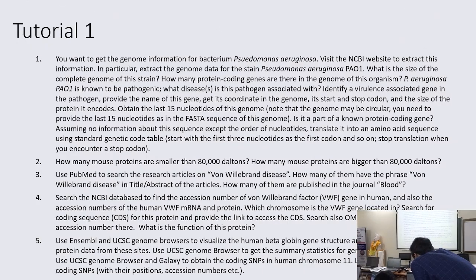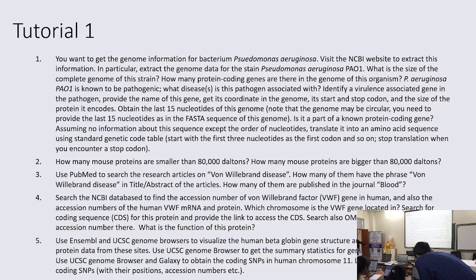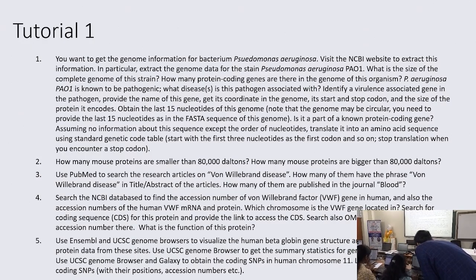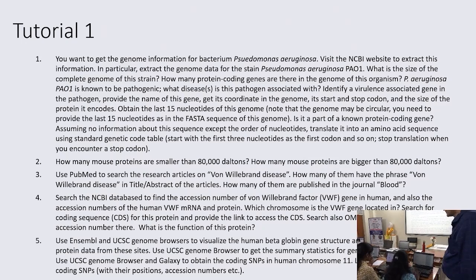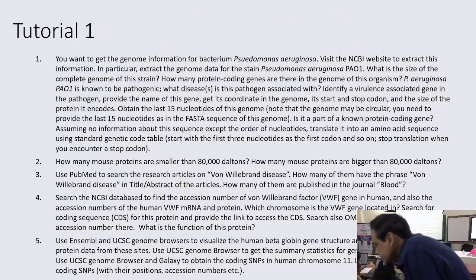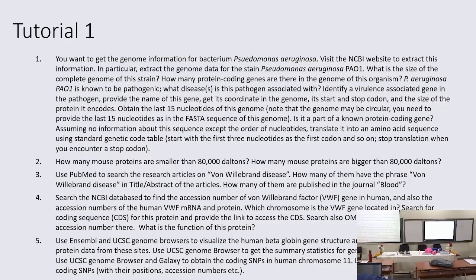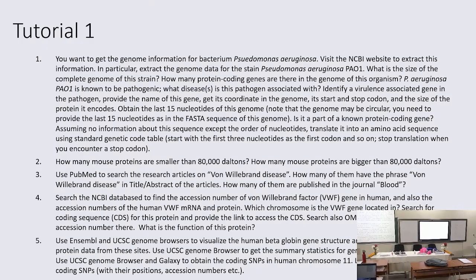Got it? No, no, you got it. Click on this. That was the accession number, and go down, see the genome size, right? Good. Scroll down. Oh, you're in taxonomy, and why not start with the genome actually? So maybe here, or you can go from NCBI genome.